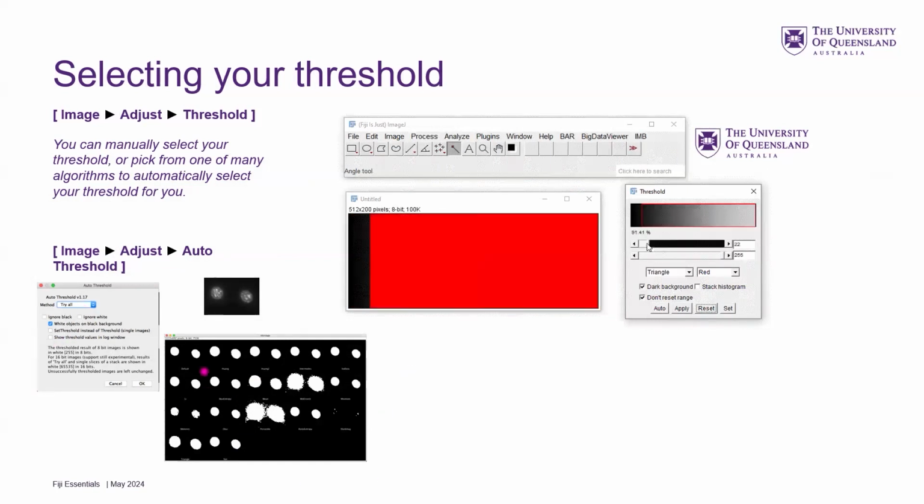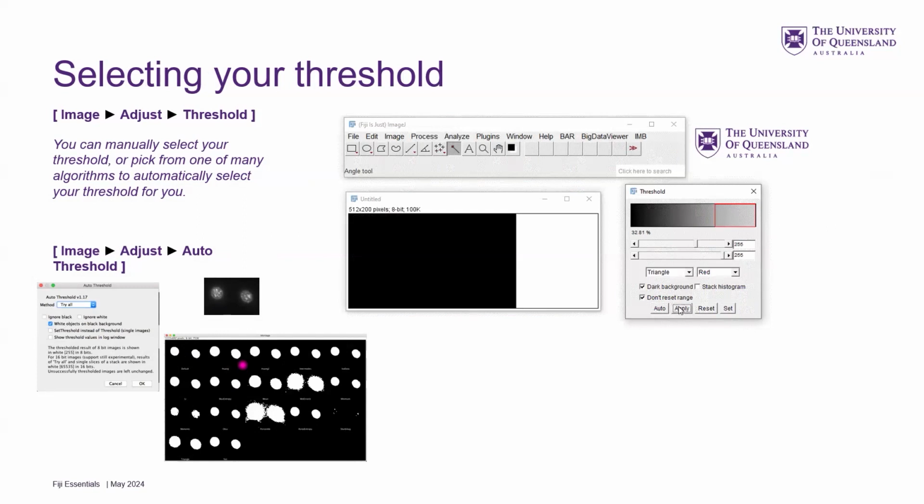And you can appreciate that, okay, these 2 nuclei are pretty obvious where they are, but there's a few that are more generous. There's a few that are only picking up the little nucleoli. So they're just picking up different decision points where to cut between foreground and background.